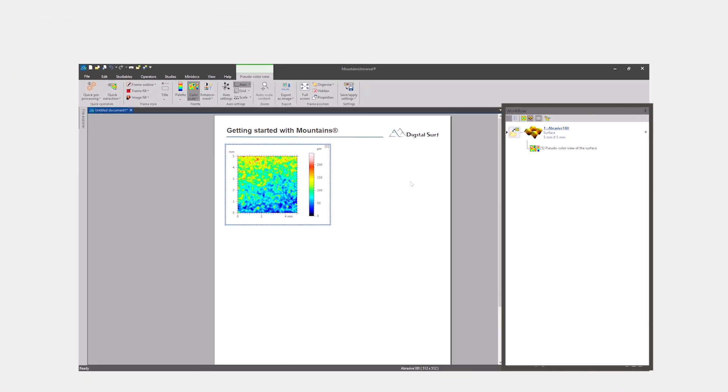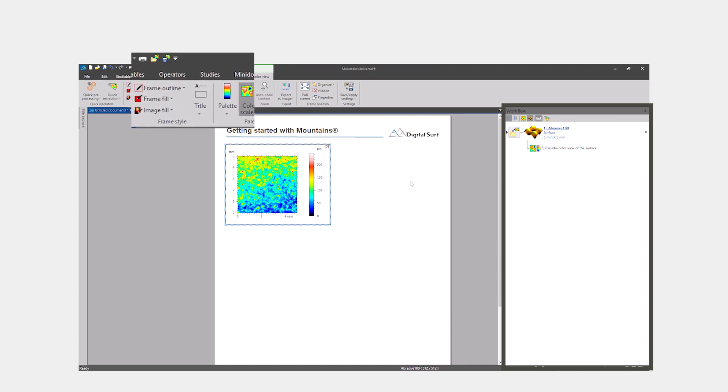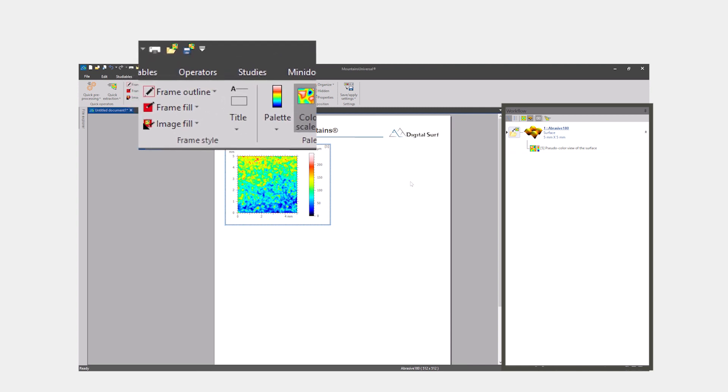The workflow appears on the right. Operators and studies can be accessed via the contextual ribbon, which appears at the top of the interface.